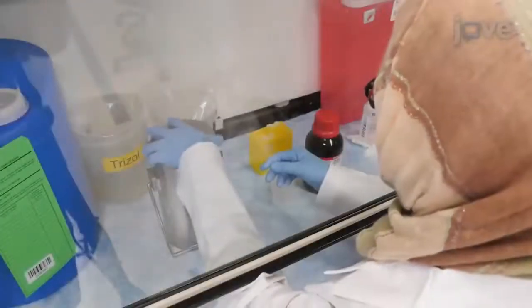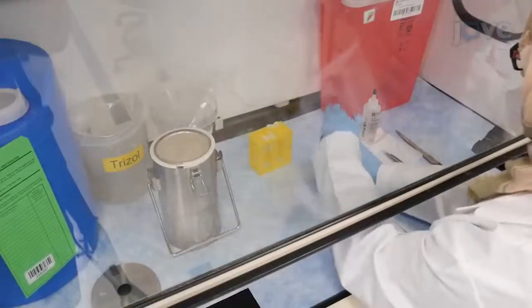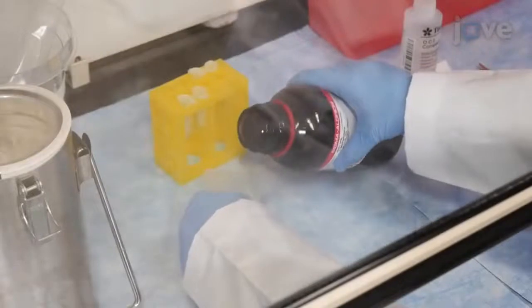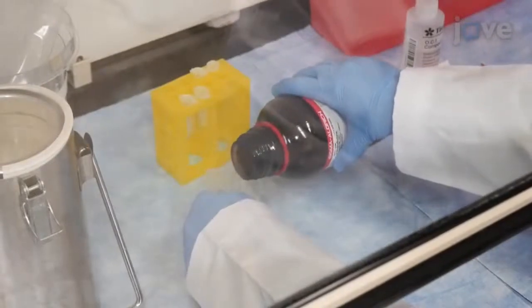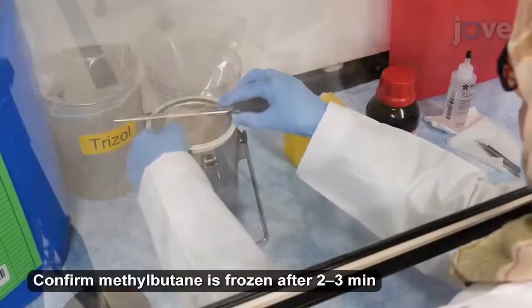To begin, prepare a liquid nitrogen bath by pouring liquid nitrogen into a Dewar flask. Next, pour 10 milliliters of methylbutane into a 20 milliliter plastic beaker and transfer the beaker to the liquid nitrogen bath.